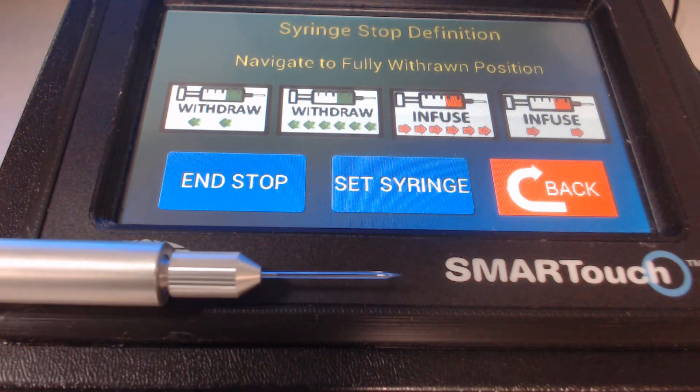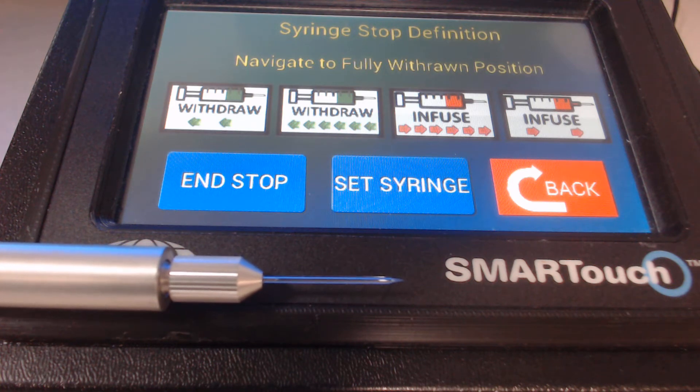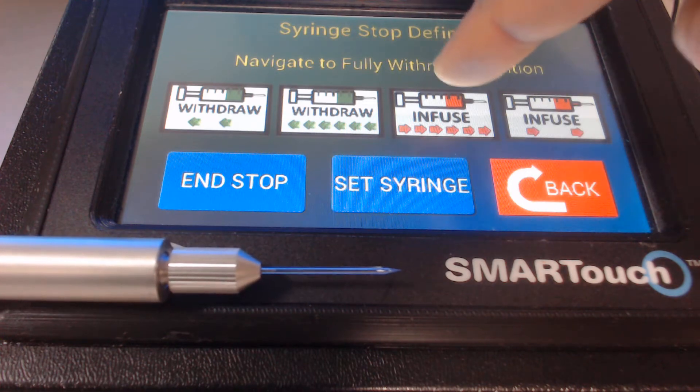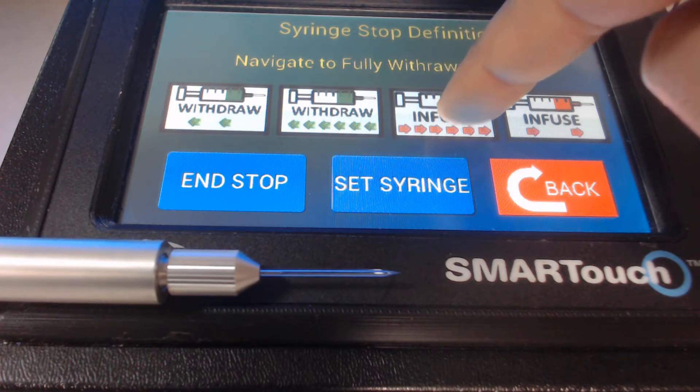At this point, I have the oil backfill glass micropipette installed onto the nanoliter injector. The first step is to infuse or inject some oil out of the tip.